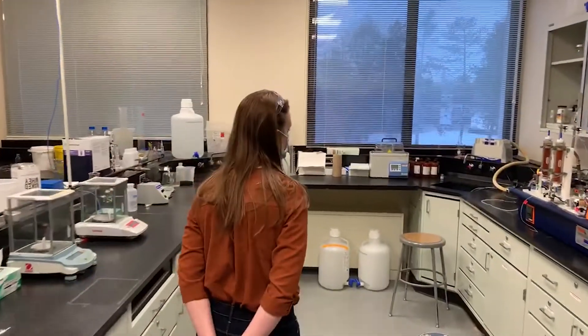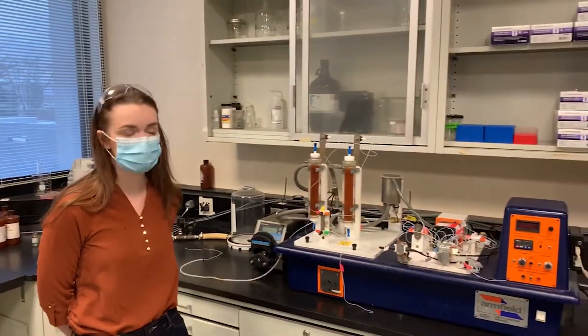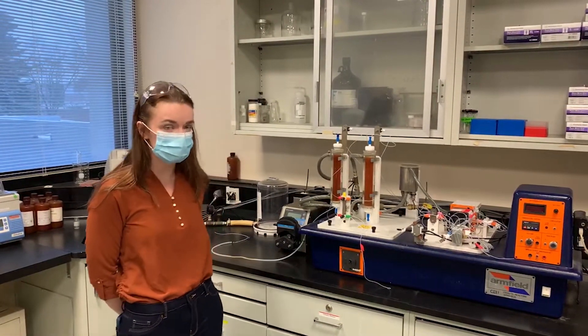Basically what we have here is a catalytic reactor. The experiment that we use this to run is looking at the acid-hydrolyzed conversion of sucrose into glucose and fructose.